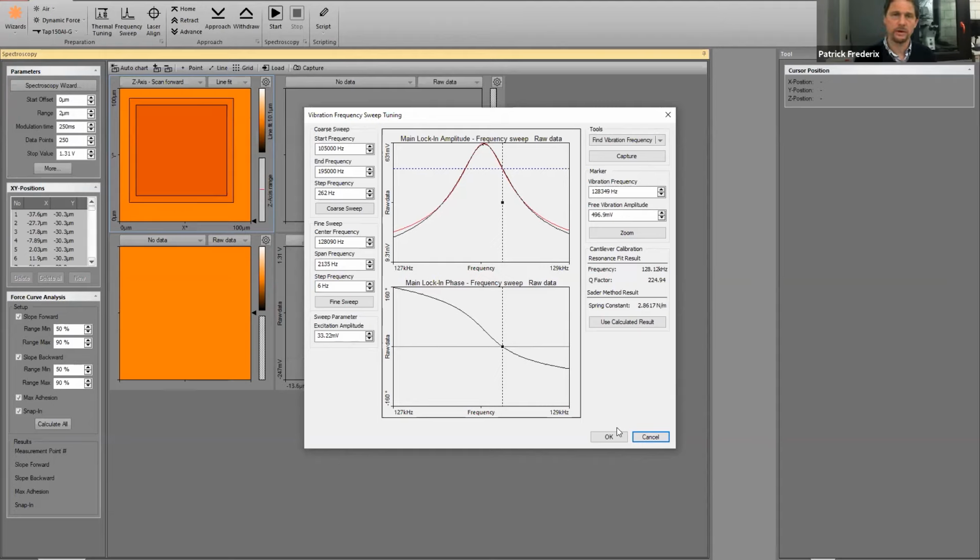In addition, if you have a large adhesion force, as you also saw in the force curve that I showed you in the ANA software, the Z range needs to be sufficiently long to pull the cantilever away from the surface. This depends clearly on the polymer. On some polymers, you can do with a very small range because you have hardly any adhesion, but if you have adhesion, you take a longer range. If you want to compare data, I personally prefer to always take the same range and the same tip speeds when doing that.